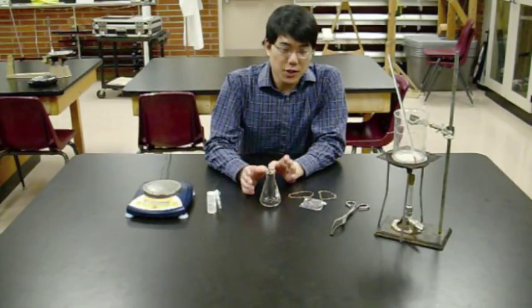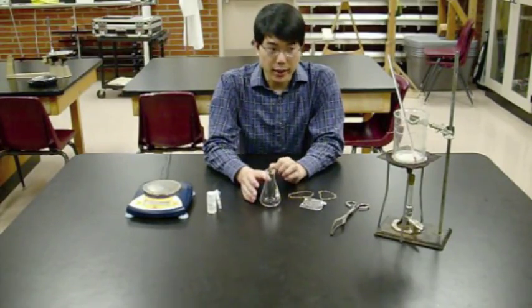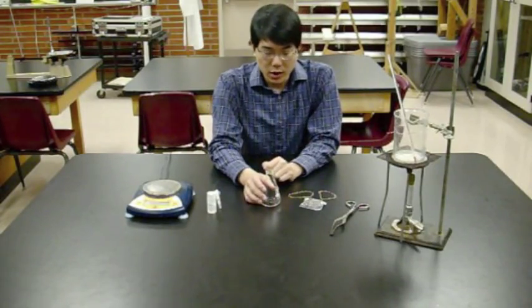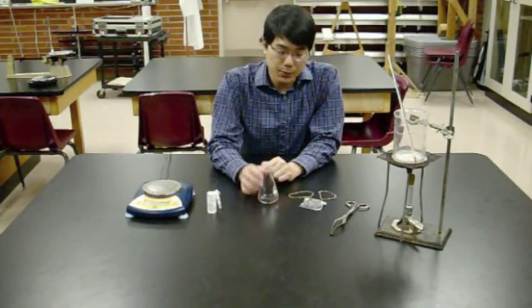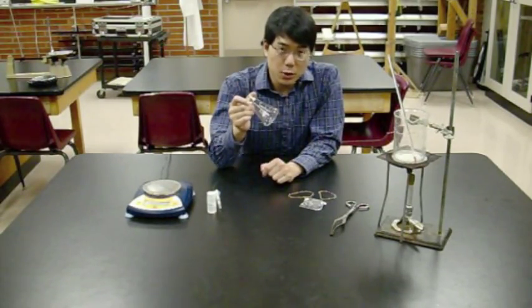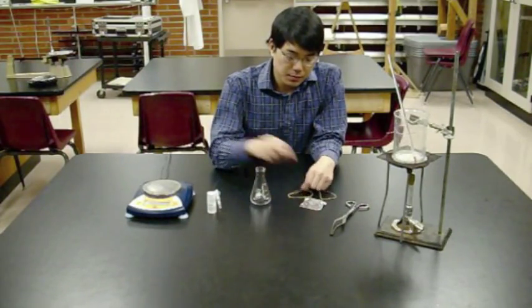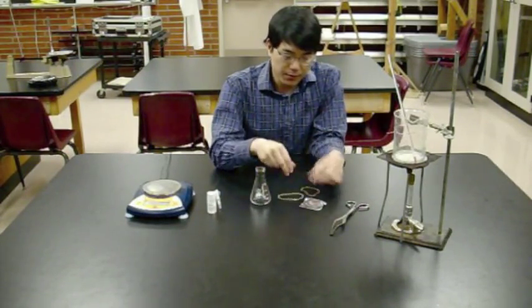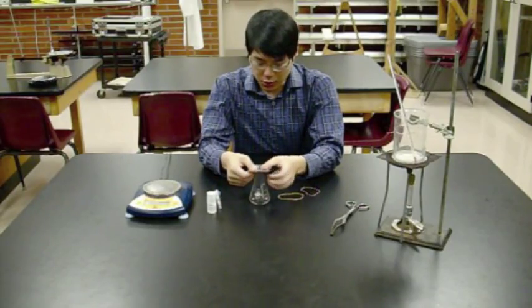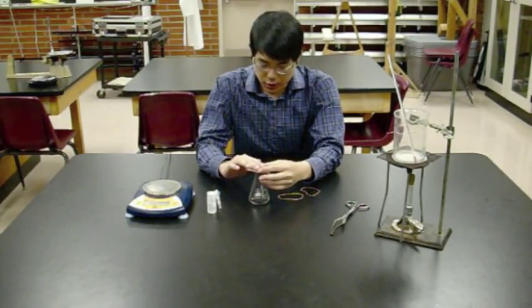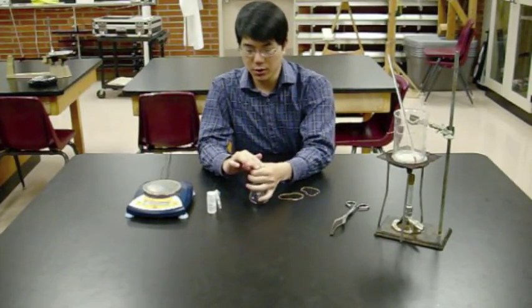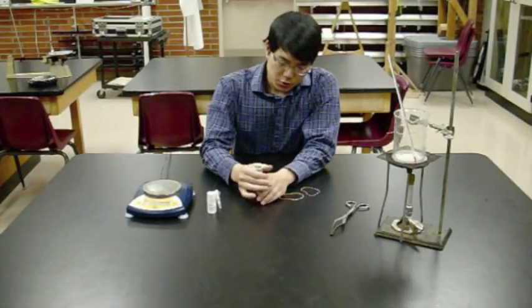By now you should have a water bath going. Now we need to make the Dumas tube from four components: the 125 milliliter Erlenmeyer flask, two rubber bands, and a piece of aluminum foil. Center the aluminum foil over the end of the flask and collapse the edges down to make a form-fitting cap.